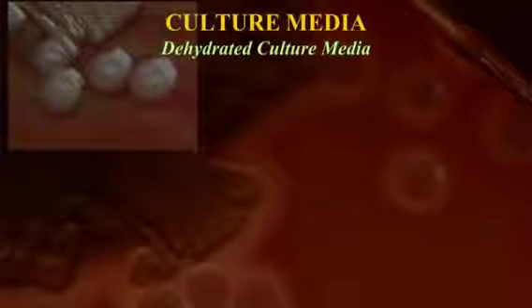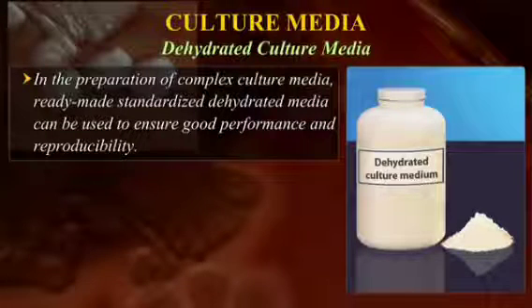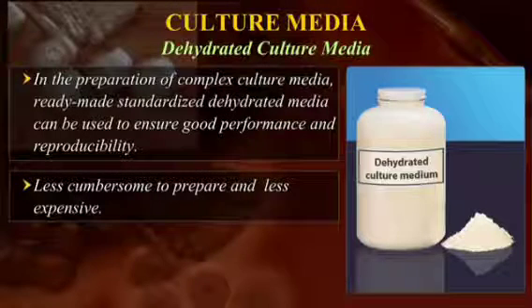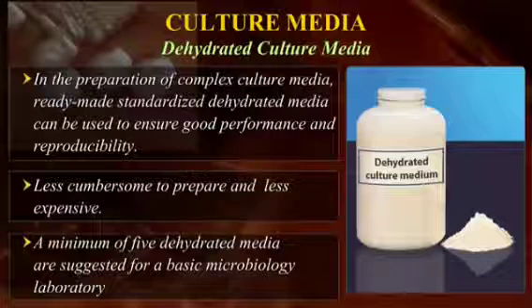Dehydrated culture media. In the preparation of complex culture media, ready-made standardized dehydrated media can be used to ensure good performance and reproducibility. They are less cumbersome to prepare and also less expensive. A minimum of 5 dehydrated media are suggested for a basic microbiology laboratory.